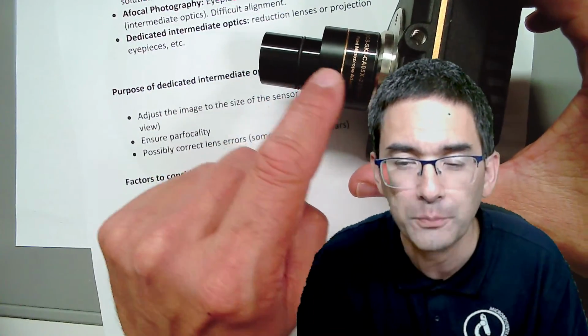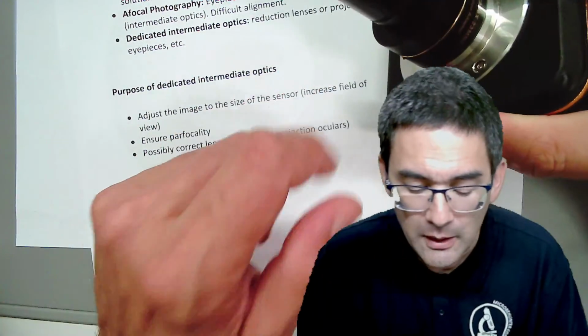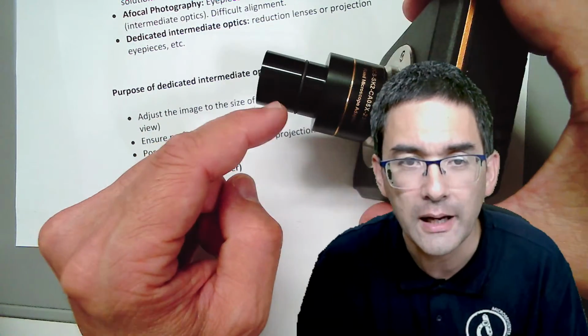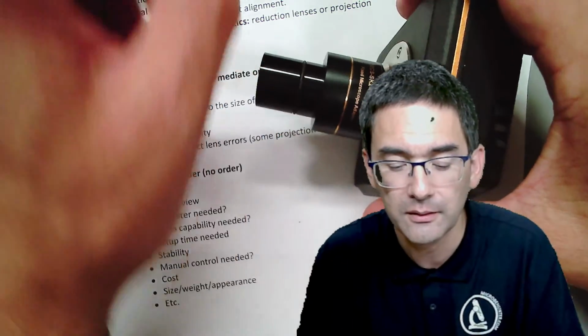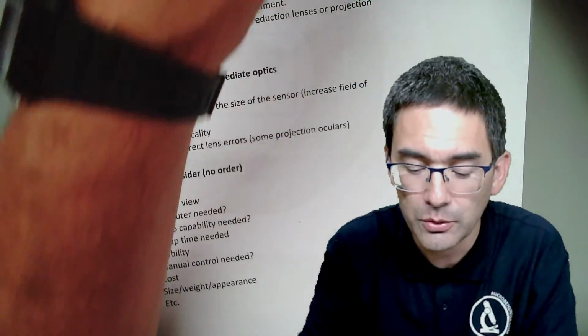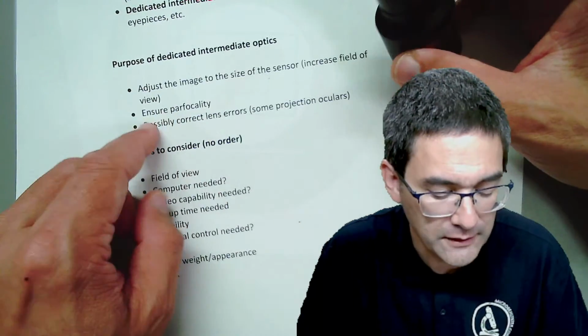Okay, so-called reduction optics. I mean, why is this even necessary if it also works without it? Well, because those reduction optics that you have over here perform several important functions that you basically don't have if you are missing the optics. And the functions are listed here.